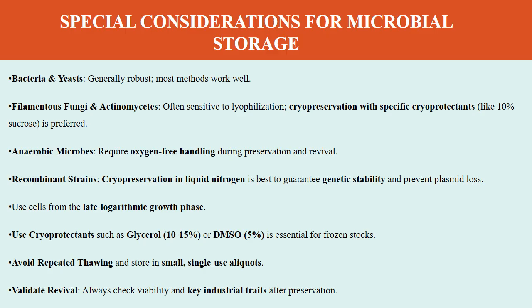Use cells from the late logarithmic growth phase. Use cryoprotectants such as glycerol or DMSO, which are essential for frozen stocks. Avoid repeated thawing and store in small single-use aliquots. Always check the viability and key industrial traits after preservation.